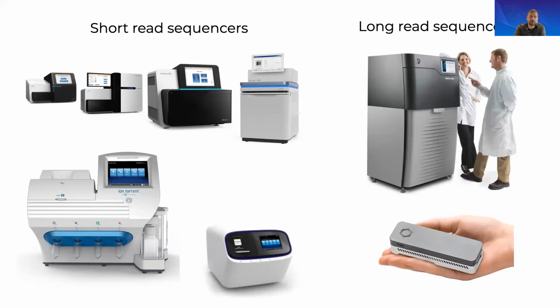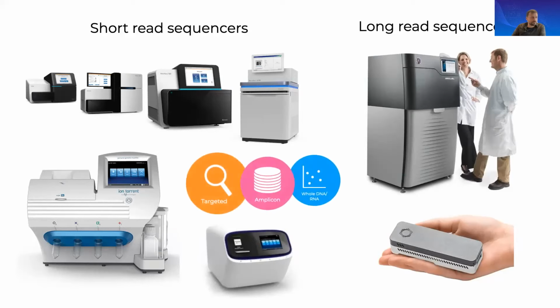And recently you might have heard that these technologies have been used to remap the human genome and identify a lot of the repeated sequences and actually determine what is in them. Now, these types of sequencers could also vary based on what it is that we are feeding into the machine. And that is what's called library preparation.